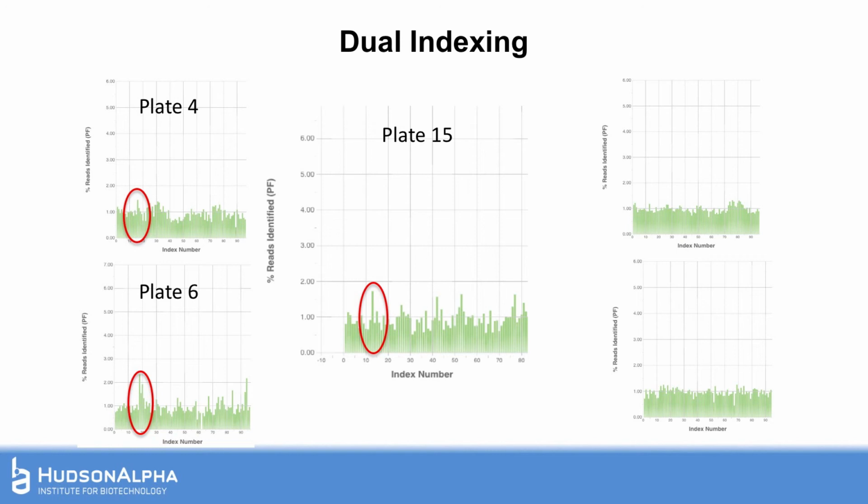Stated another way, very simply, I'm suggesting that all of our data shows that the difference of 16 nucleotides over the course of the entire library insert actually makes a difference in how it sequences in a reproducible manner. So that's why I say oversimplifying an index scheme has consequences, and indeed needs to be looked at quite carefully when you consider designs like I suggested on the earlier slides of 192 samples across an S4 workflow.